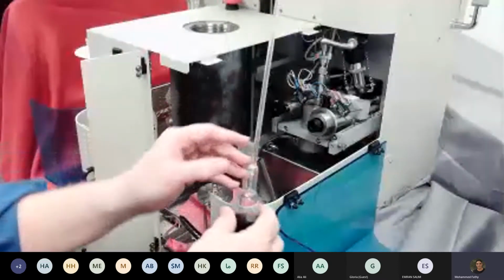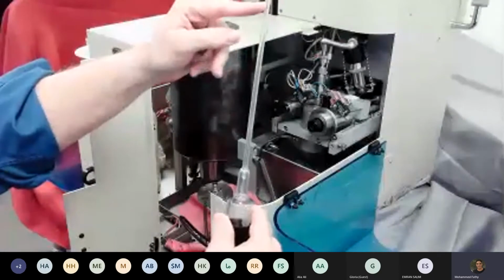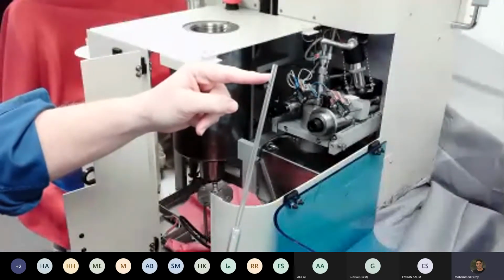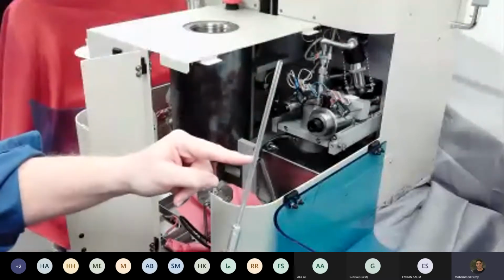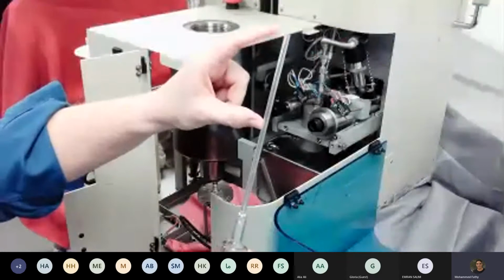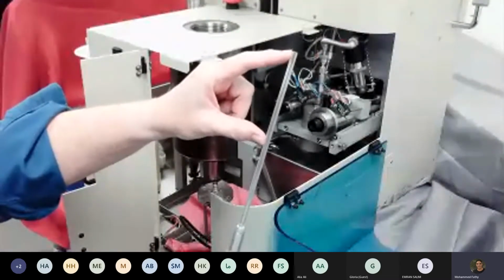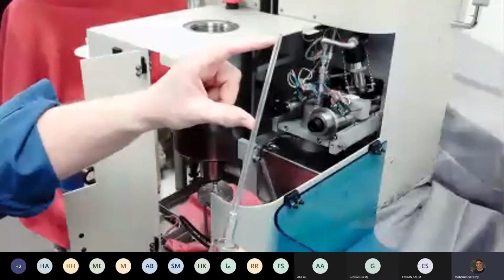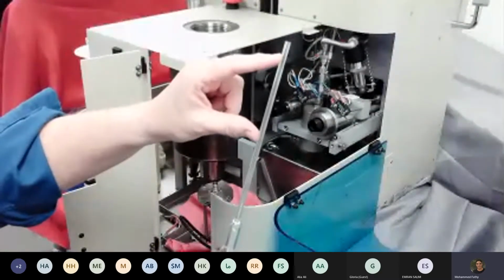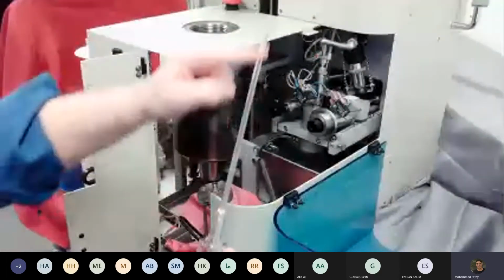system. So what I mean by this is, if after the analysis, the mercury starts up here, right, when it's full. So in the low pressure system, maybe some mercury is intruded, but maybe it only extrudes back to this far. So we have this much mercury unused or used up, okay, the instrument can refill this automatically. So when the sample cell goes into the high pressure system, now we have all of this volume available.